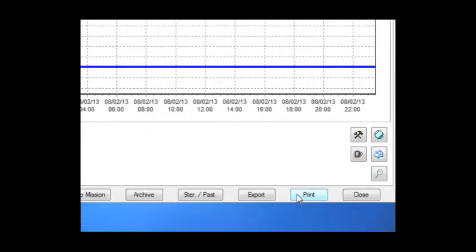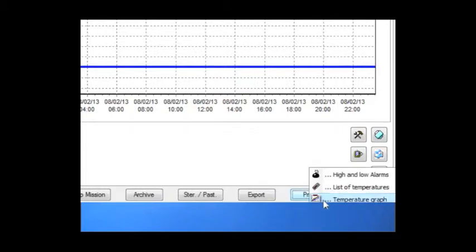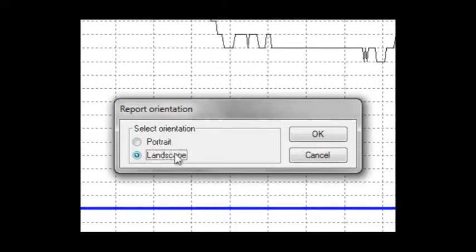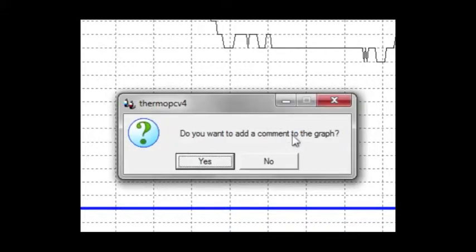Of course you can print the list of alarms, the list of temperatures and the graph. You can add a comment before you print.